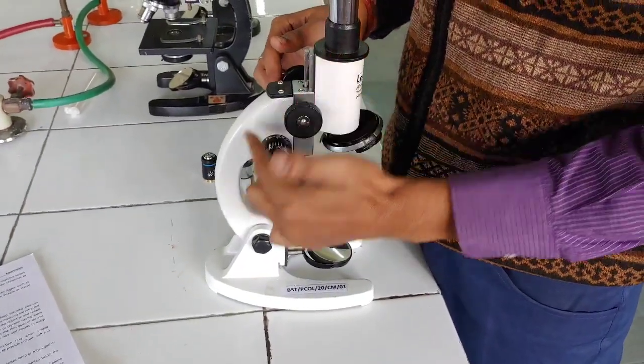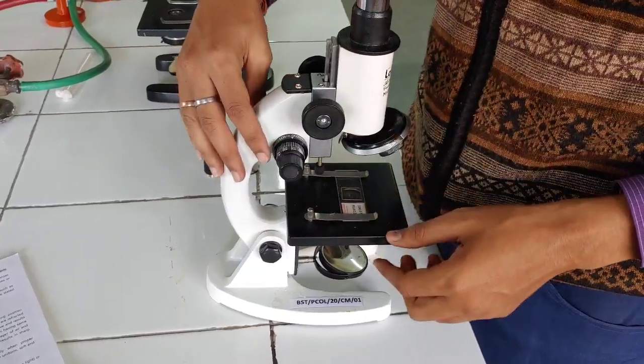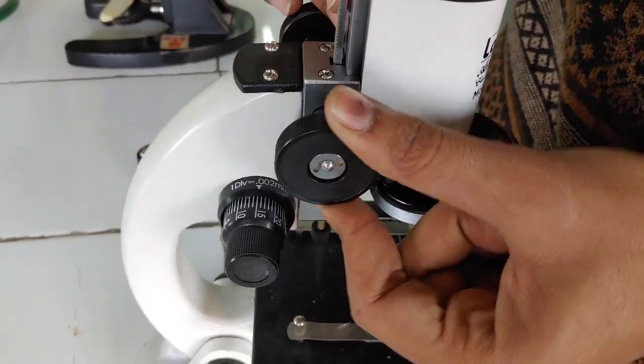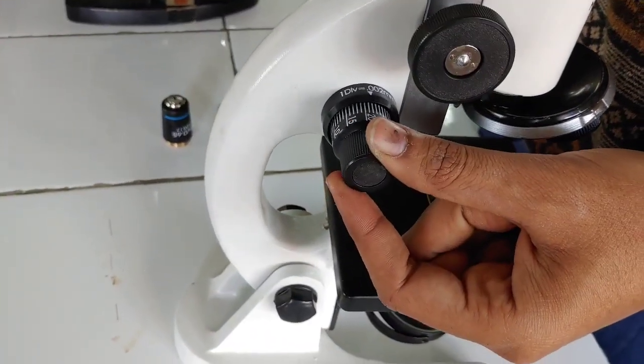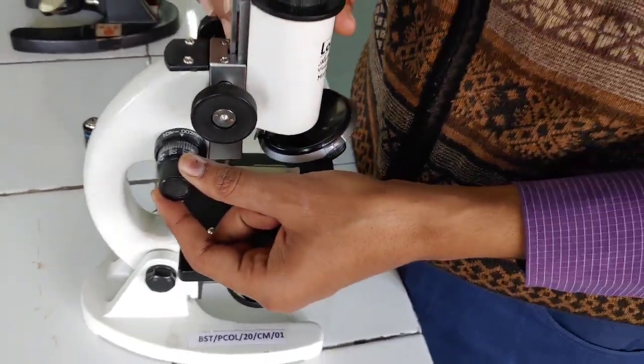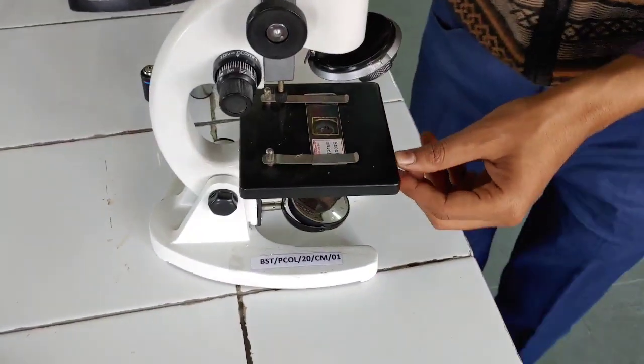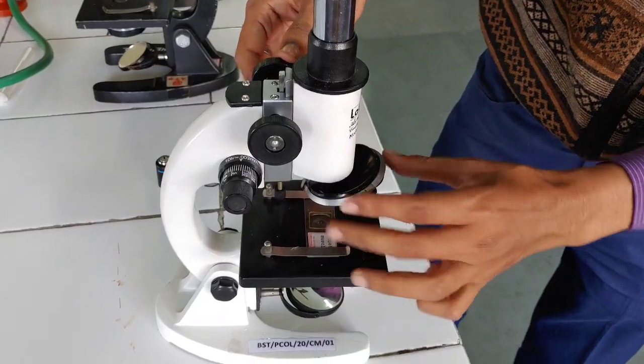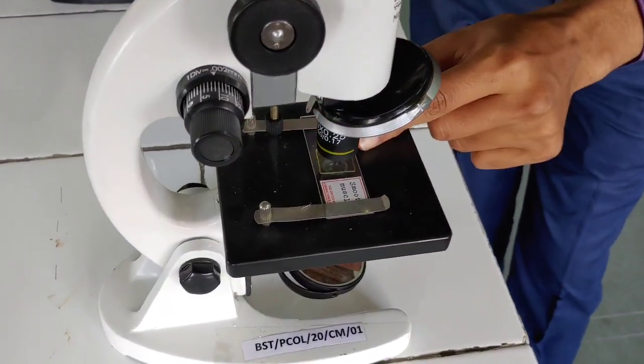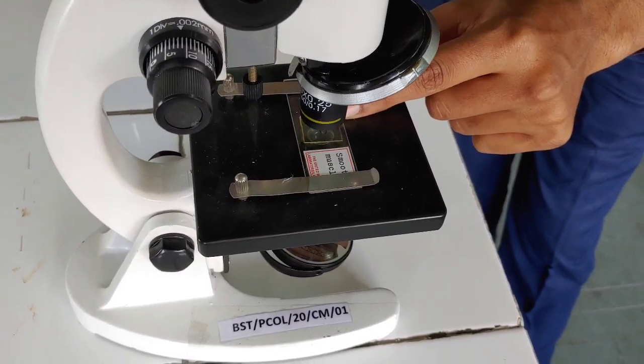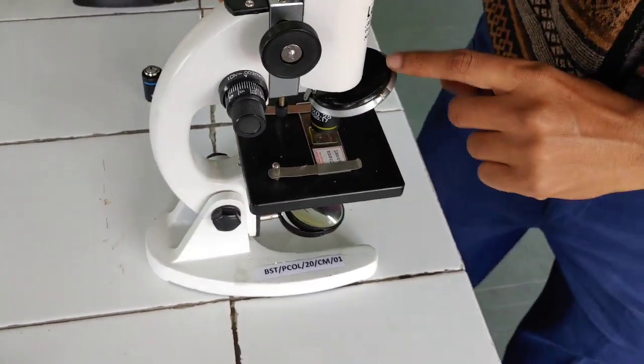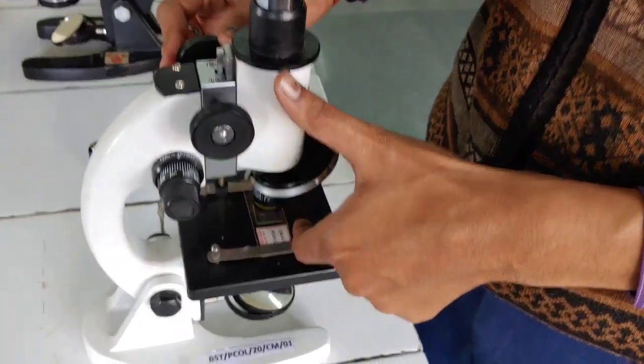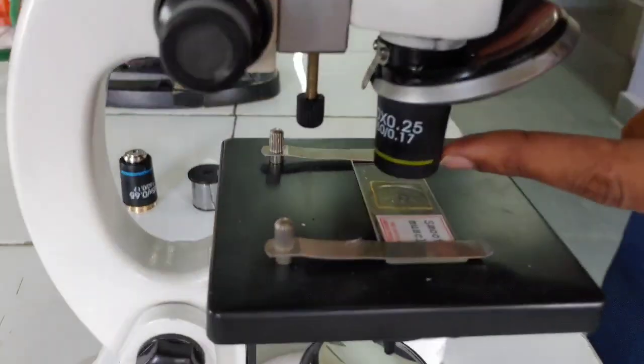Now, the last component is the adjusting system. There are two adjusting systems. First is coarse adjustment knob and next one is the fine adjustment knob. If you move the coarse adjustment knob, you can see in the video that you can focus more clearly on the slide or on your specimen. What is the function of coarse adjustment knob? It is used to bring the specimen into appropriate near focus.